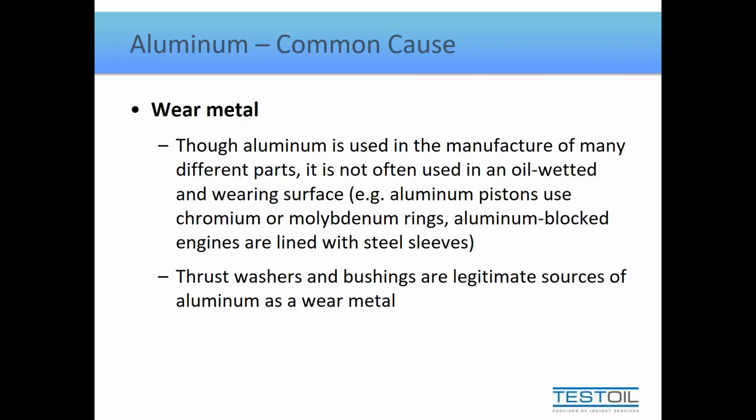Now, normally in the atmosphere, we always have dust. Dust on its own is generally silicon dioxide. It's a breakdown product of quartz, sand. When the color of the sunset or sunrise changes, the contaminant has gone from dust to dirt. Now, a lot of folks might think dust and dirt are the same, but dirt is actually aluminum silicate. It has about a 3-to-1 ratio of silicon to aluminum.